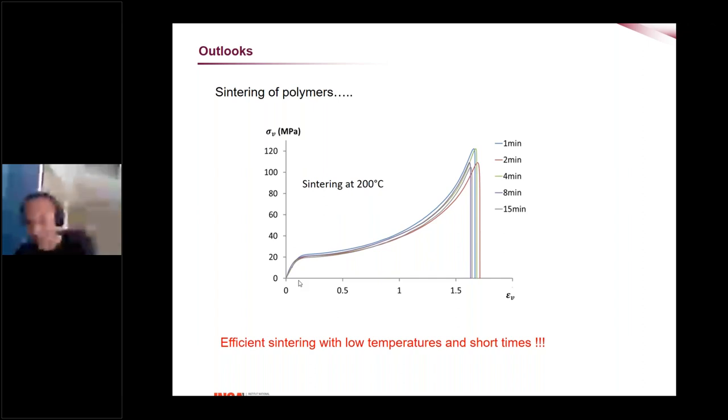A couple of questions. What should the dimensions be of the hot compression specimen in the Gleeble simulation to avoid generating heterogeneous deformation? And it may be a bit dependent on the type of test you're running, but in terms of deformation, for the hot compression specimen, what do you recommend? Okay, so usually our specimens are the ones that are given by DSI. So 15 length by 7 diameter, am I right? Or 10 diameter? Yeah, they do vary. The ratio is what's important to us. So the ratio is usually between 1/3 and 2/3, by the way.